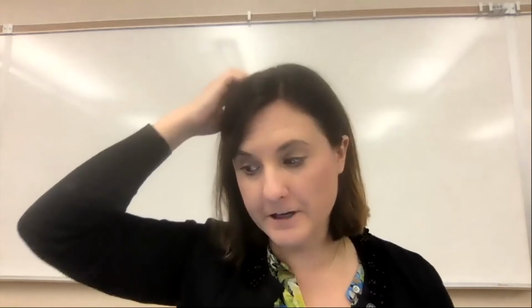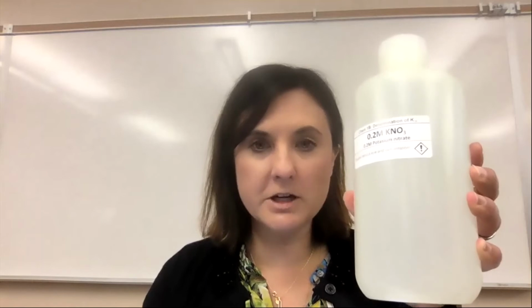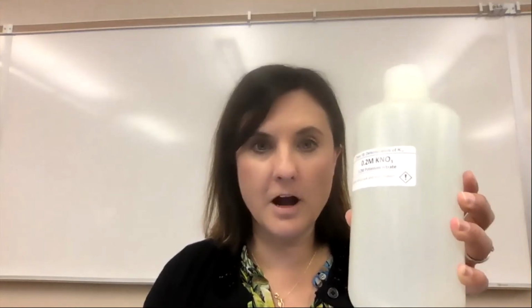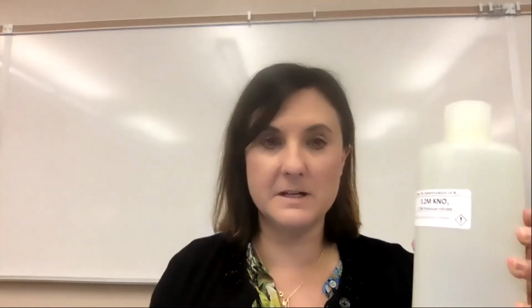In experiment 10, you're going to be using 0.2 molar potassium nitrate, and that's our bigger bottle here. It's your dilution agent. Do not pipette from the bottle. You're going to pour this into a beaker, and it tells you about how much you need, about 50 mils.